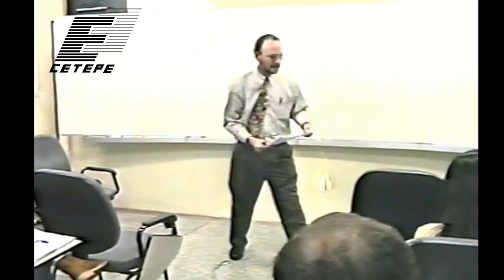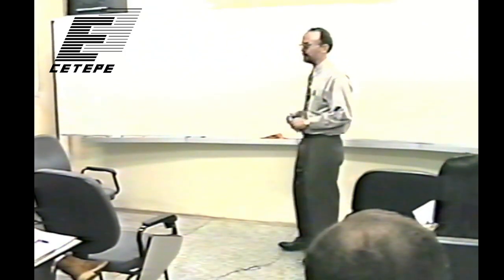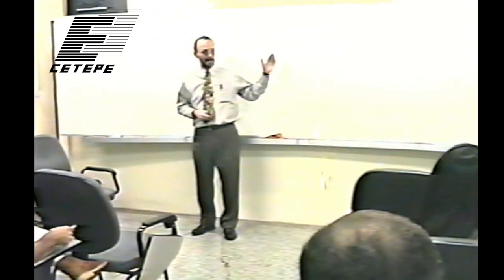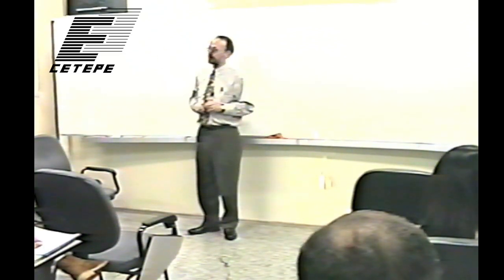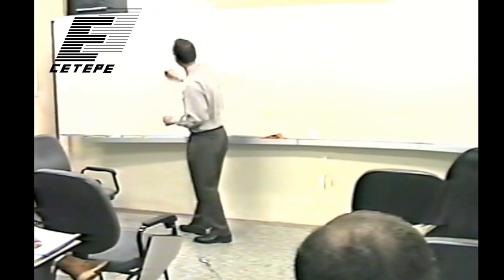So someone asked me a question over the break, and I'm very glad they did, because one of the main reasons I wanted to talk about these physical effects and that model of the atom had to do with this concept called K-edges. And you've seen it in a number of the graphs that we drew.